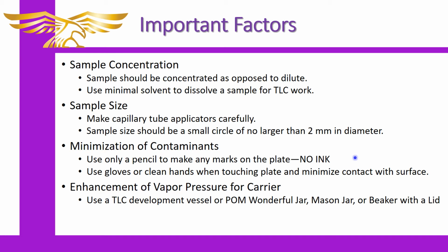I would suggest using a regular wooden pencil with a nice big broad piece of lead rather than a sharp pointed one, or a mechanical pencil that has the smaller leads, because the problem with that is they're going to have a greater tendency to scratch the material on the plate. This is also why it's important that you only put a very, very small mark on the plate instead of going all the way across. And I'll show you an example of what I'm talking about on another slide that has the examples drawn out for you.